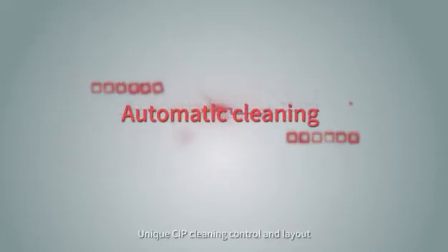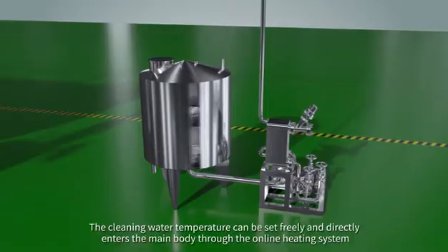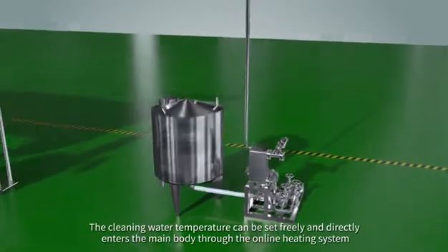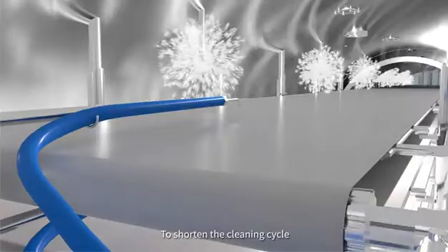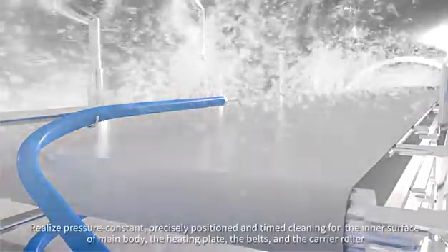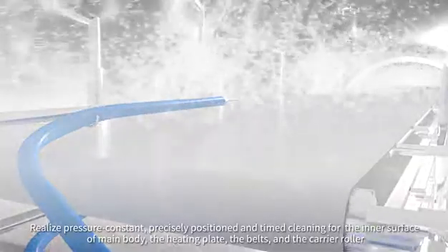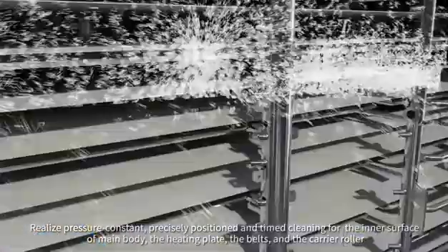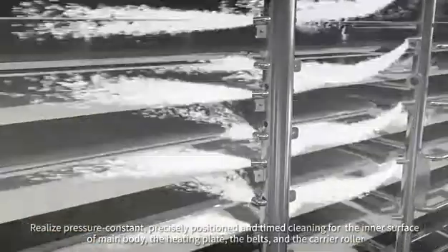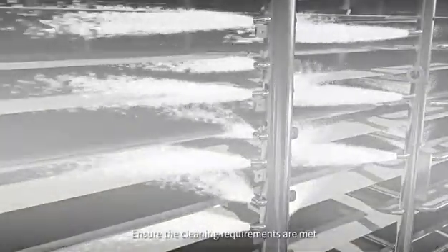The unique CIP cleaning control and layout allows the cleaning water temperature to be set freely. Water enters the main body directly through the online heating system to shorten the cleaning cycle. This realizes pressure-constant, precisely positioned, and timed cleaning for the inner surface of the main body, the heating plate, the belts, and the carrier roller, ensuring all cleaning requirements are met.